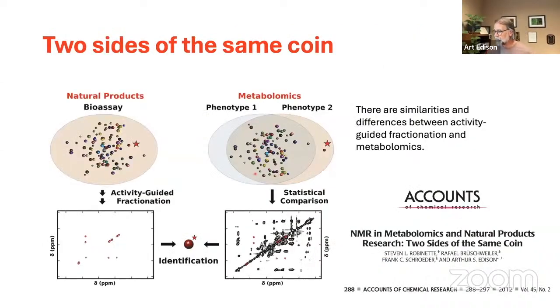And around that time, we recognized the process that I just described in natural products chemistry, where you start with an extract and you have some bioassay. In the case that I just went over, are male worms attracted to whatever fraction we have? You go through several different fractionation steps, and you end up with some product that is more or less pure, and you try to figure out what that is using NMR spectroscopy and mass spectrometry. That's the protocol that's used routinely in natural products chemistry.